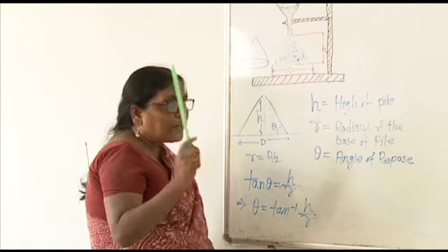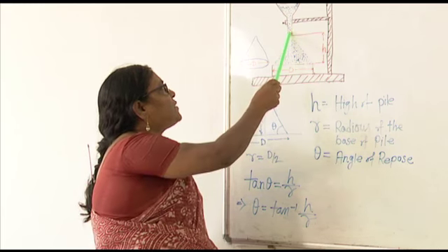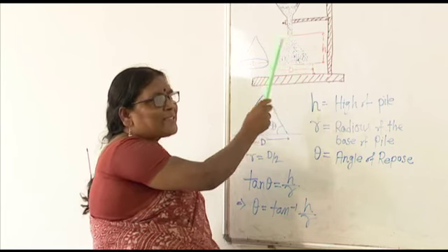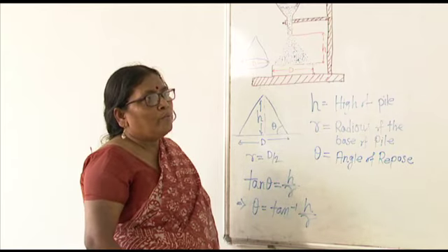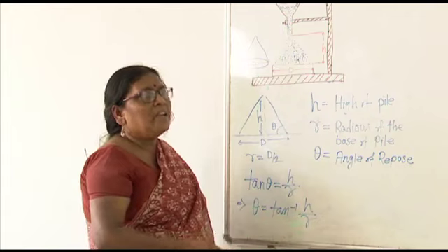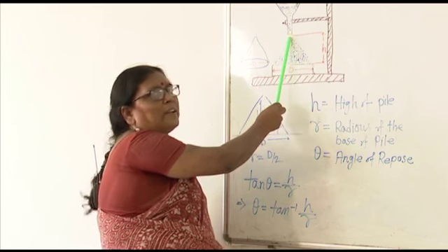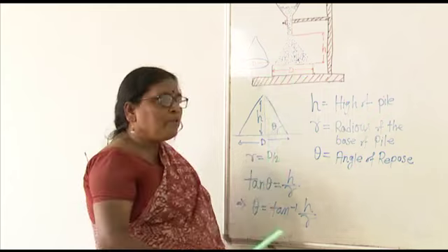So what I want to say is that the distance between the tip and the ground should be as less as possible. Now how do you know what should be the distance? First, make a rough experiment, make it fall, you know this is the expected distance, and fix your funnel at that place. That is one way. Or you can do one more thing.